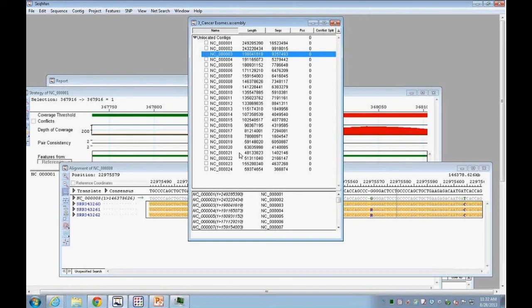If you're working on an organism that's not present there, you can request that a package be constructed for you. What we'll do is go to dbSNP and first verify that the SNP information is curated there, and that there's enough of it to warrant making a package. If we say there really aren't SNPs curated at dbSNP, you can create a package, and I can show you that here with SeqMan. We can create a genome template package from scratch as well, and that would be a good solution for you. Perfect. Thanks, Matt. You're welcome.